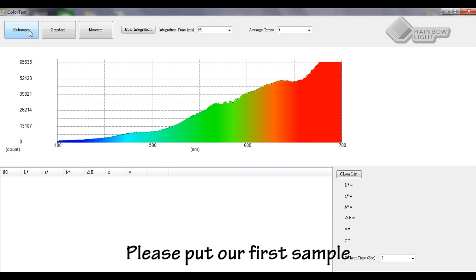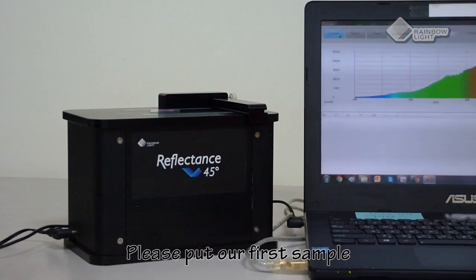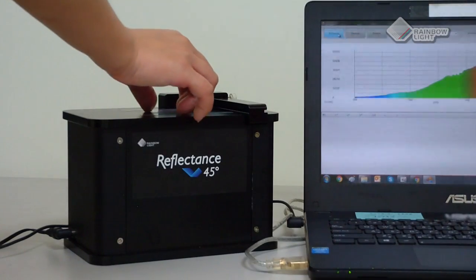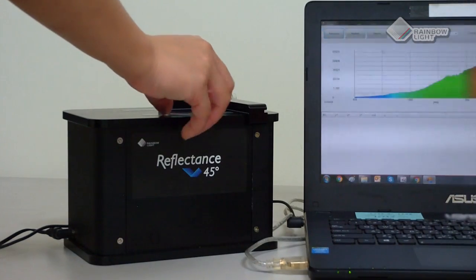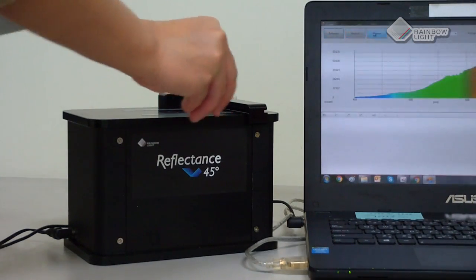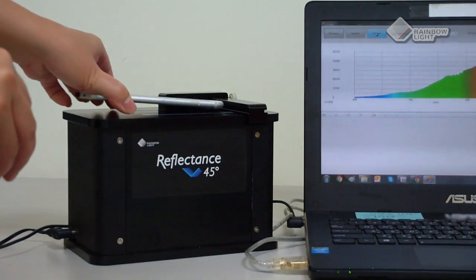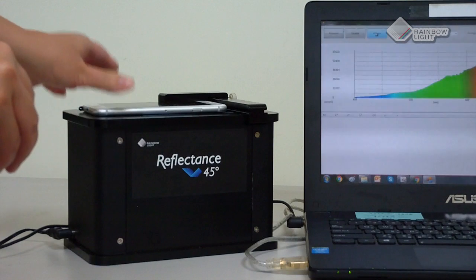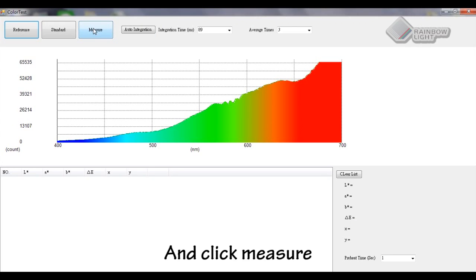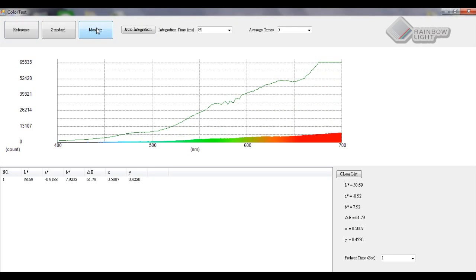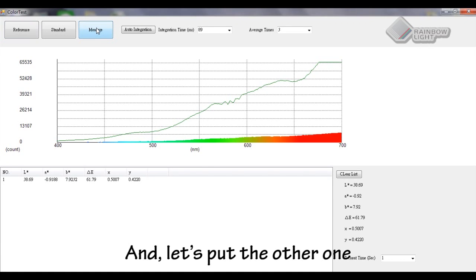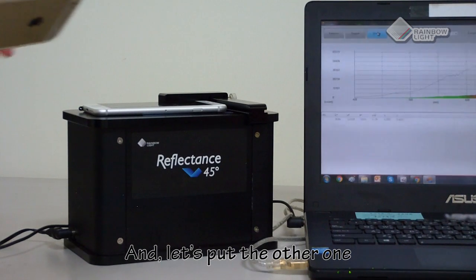Next, please put our first sample and click measure. And let's put the other one.